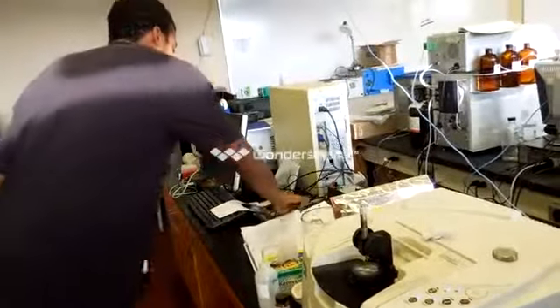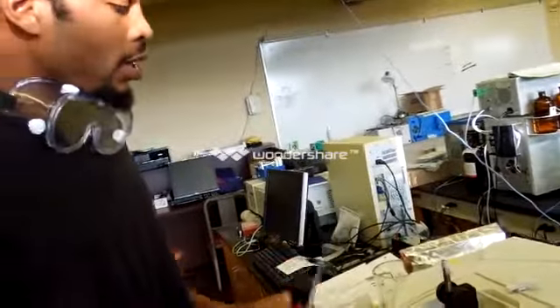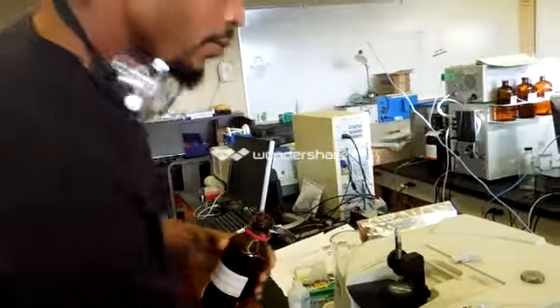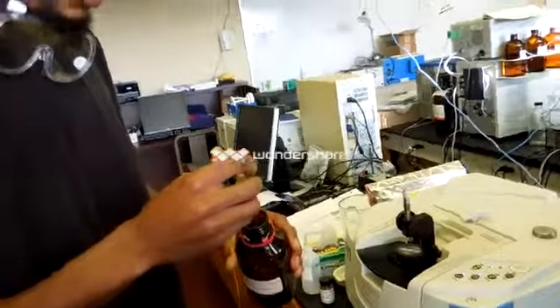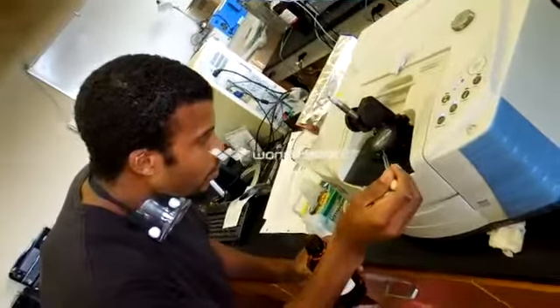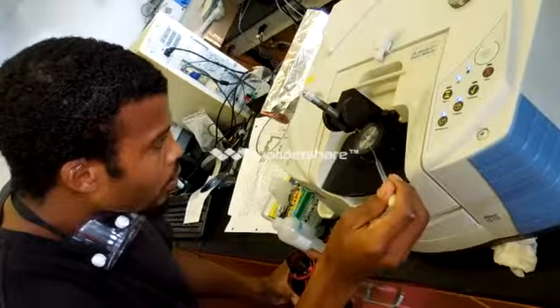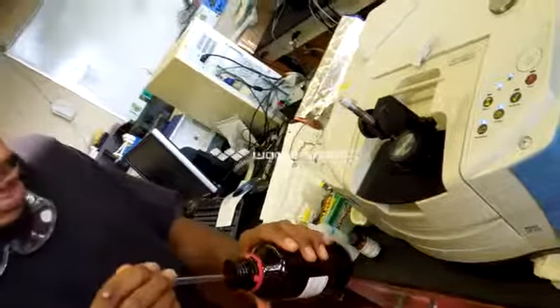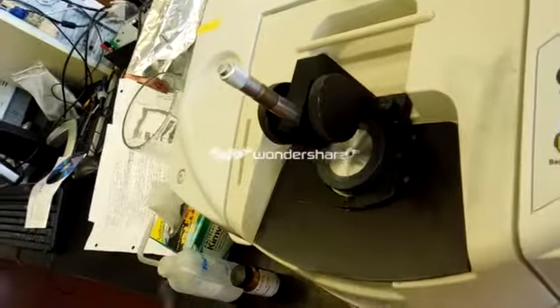Next, you want to drop your sample on it. Today we are working with dichloromethane, or methylene chloride. We take a very small amount. All that's required is a drop or two. Maybe not quite enough there. Let's get a little bit more on there. Perfect.